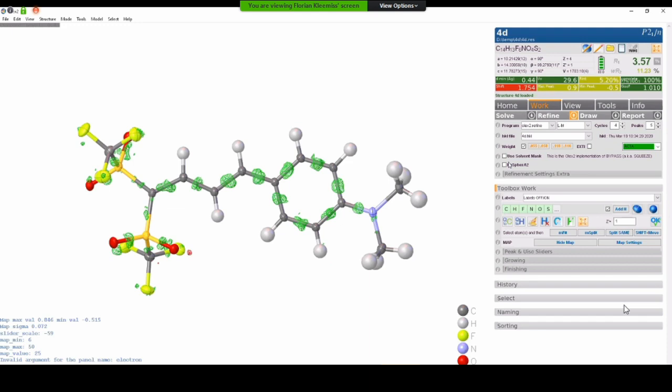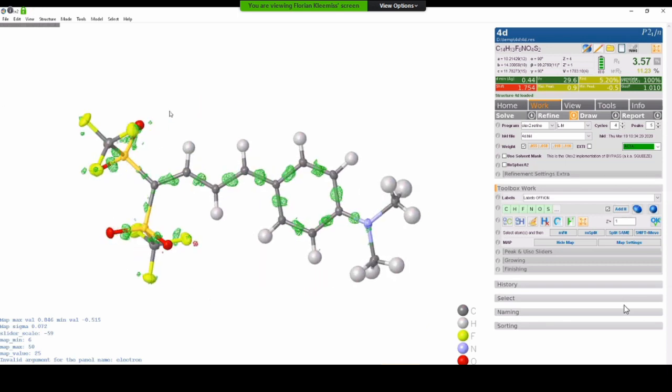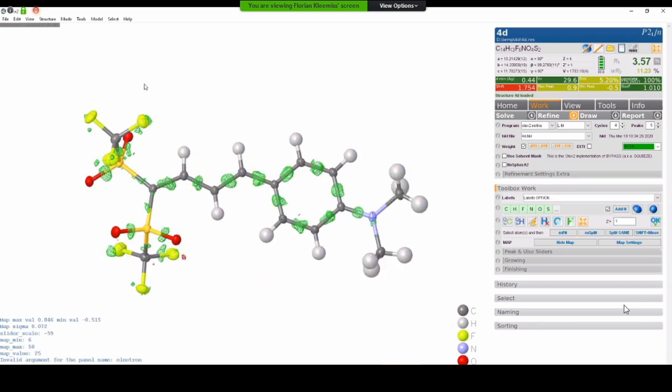So what is Hirshfeld atom refinement in the beginning? Maybe I can explain this very shortly. We know that we can calculate the quantum mechanical wave function of a molecule. For example, in a molecular compound like this, it's rather easy to imagine that we can easily calculate a molecular wave function and then use so-called Hirshfeld partitioning to cut out each individual atom of the electron density that we see from the wave function.